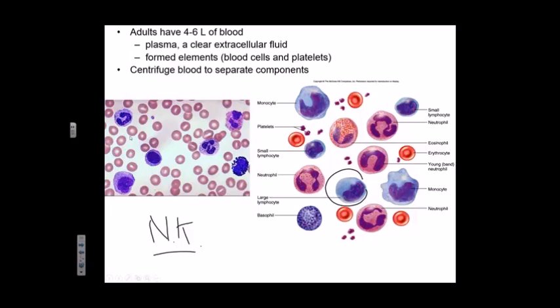There's a bunch of red blood cells in there too. And you might say, see all these little holes? They're really not holes. The red blood cell is a biconcave disc, and the middle is where the nucleus used to be, and the rest of the cell is where the hemoglobin is. So it puffs up, looks kind of like an inner tube of a tire, but it doesn't have a hole in the middle.